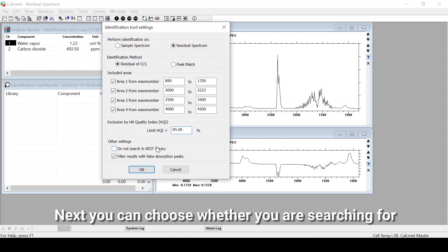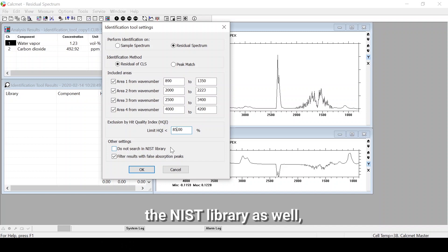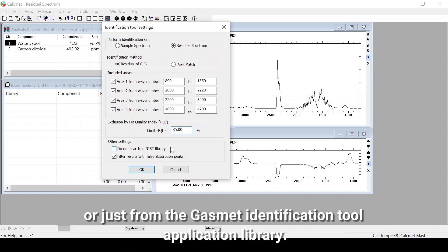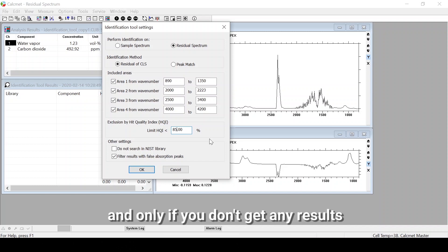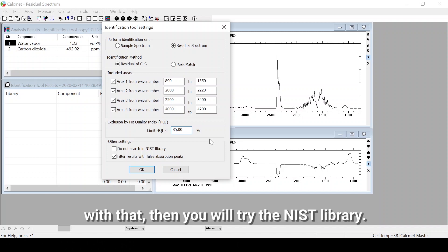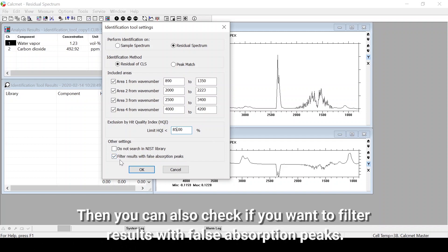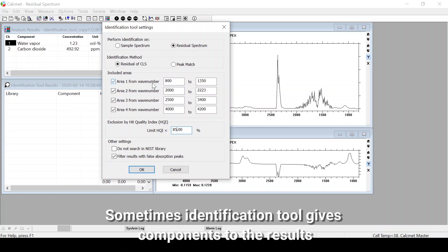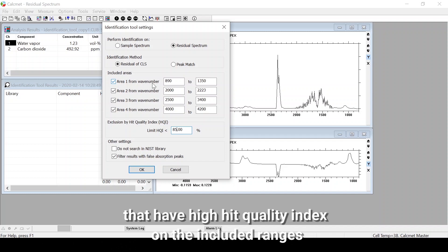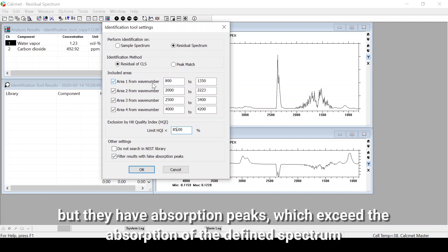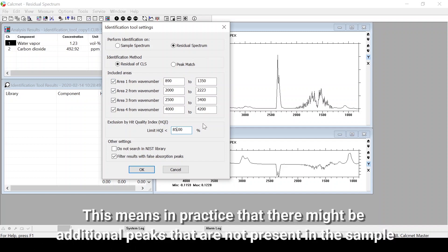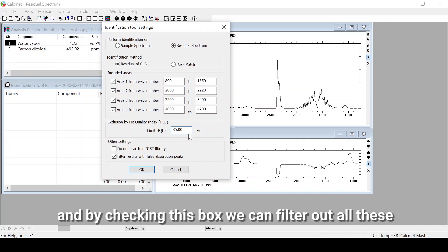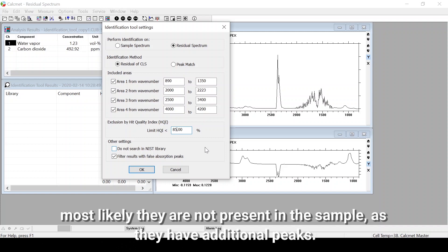Next you can choose whether you are also searching the NIST library or just the Gasmet identification tool application library. It's recommended to start with the Gasmet identification tool application library and only try the NIST library if you don't get any results. You can also check whether to filter results with false absorption peaks — this filters out components that have absorption peaks exceeding the sample outside the defined areas, as those are most likely not present in the sample.